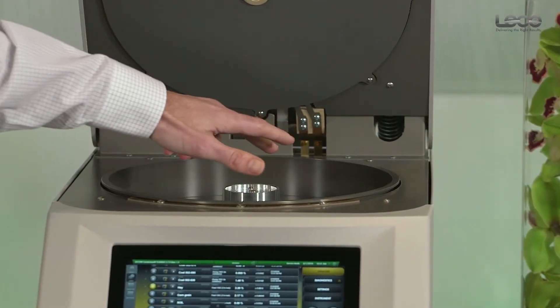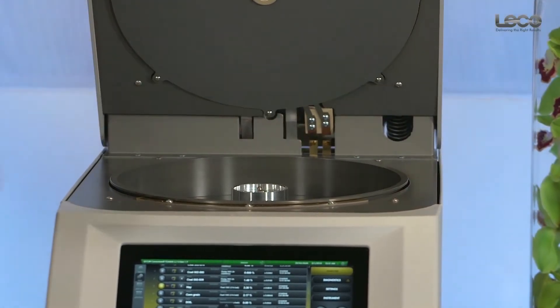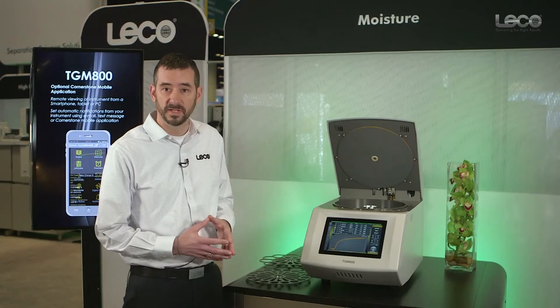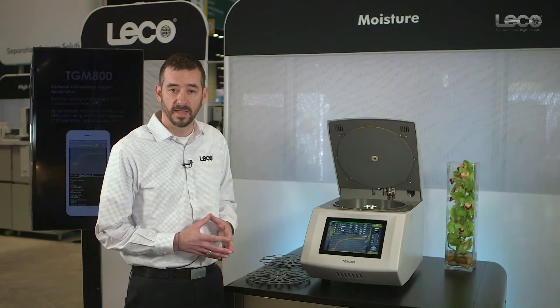Off to the right side of the oven is a thermocouple for temperature control and measurement. At the very front side we have a pedestal, which is connected directly to a four-place balance integrated inside the instrument that will collect the sample mass measurements.